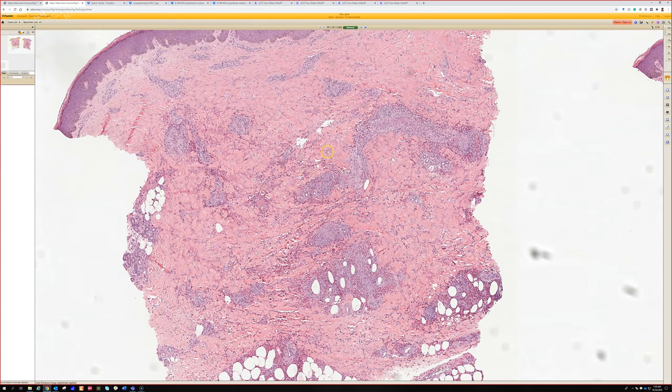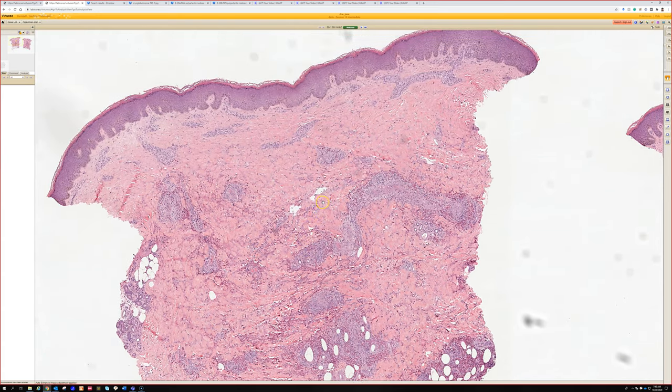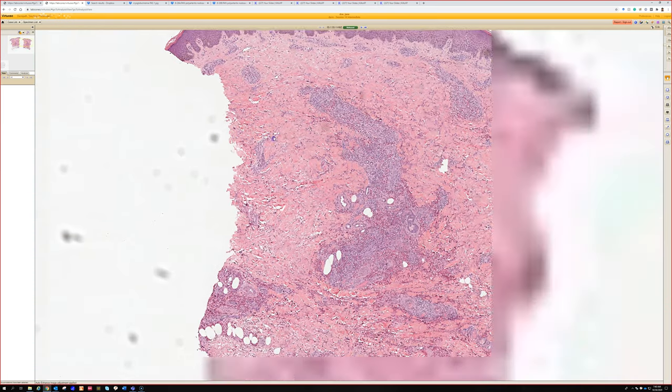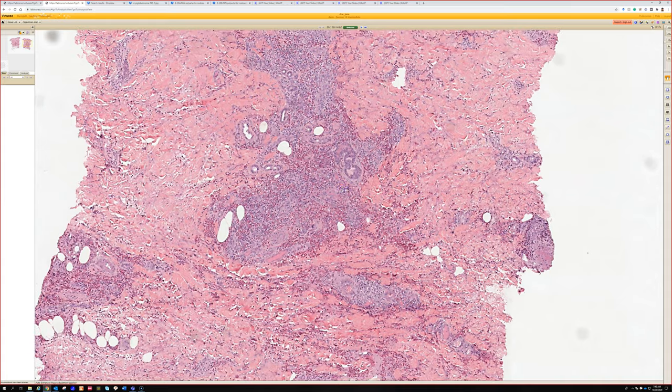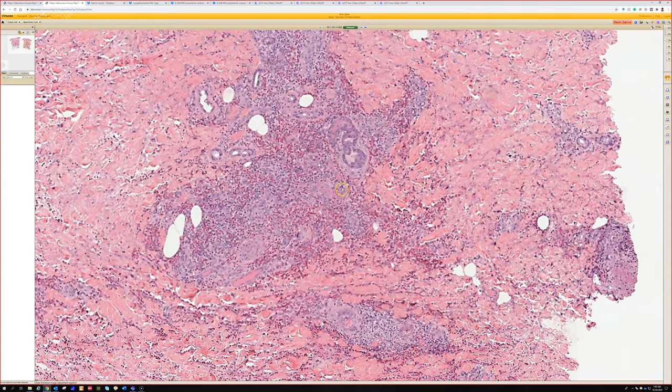Also, if you see vasculitis so robust that it's causing necrosis of the epidermis, pustule formation, or blister formation, that suggests such severe vascular involvement that it's cutting off blood flow to the skin and causing ischemic change — degenerating the epidermis. That often is a sign of systemic vasculitis. So, Churg-Strauss syndrome — good.